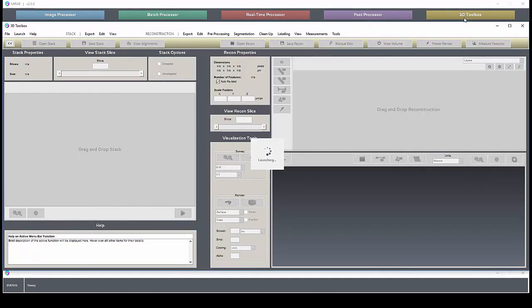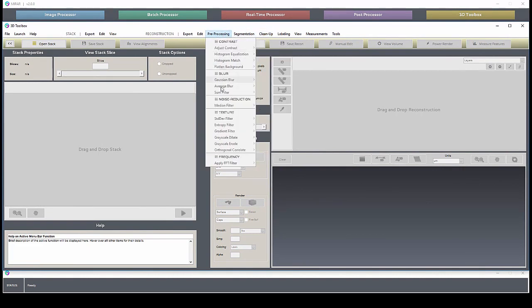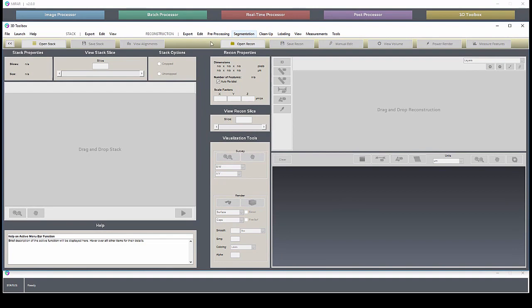Finally, the 3D Toolbox allows you to visualize stacks of images, and you can visualize the 3D reconstruction of the image stack. You can do lots of cleanup, rejecting features, pre-processing, some of the same steps that you can do in the image processor, except on the stack or on the volume, instead of just on the single image.